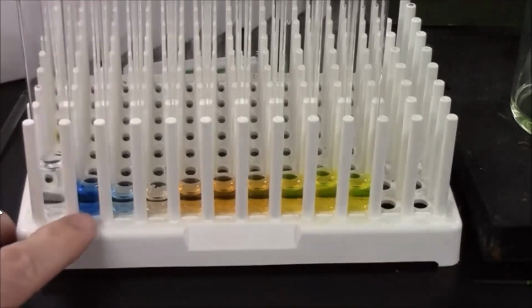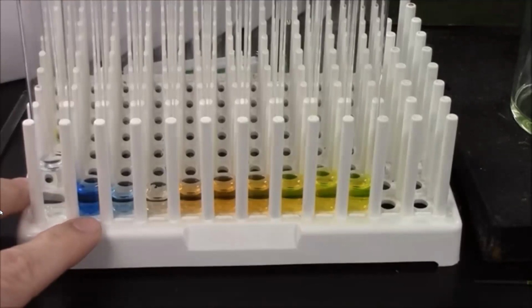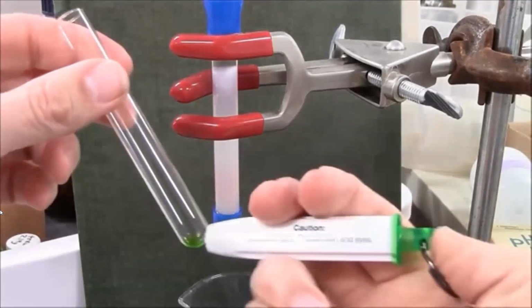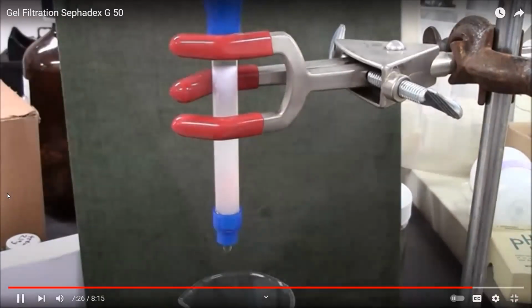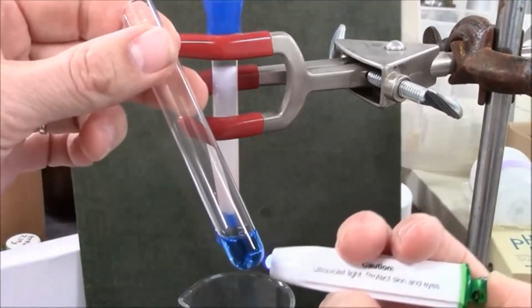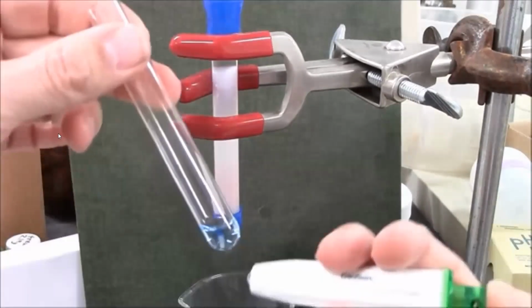Often what you want is just this first fraction with the large molecules. If you're trying to desalt a protein or remove the unbound label from a protein, then this is the fraction that has value. These fractions would just be junk. The original mixture, you can see, glows nicely. And what I believe is isolated blue dextran from the column has no glow in the UV. That's a sign that I have successfully separated out all the fluorescein.